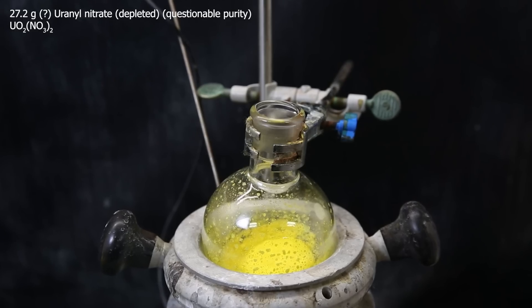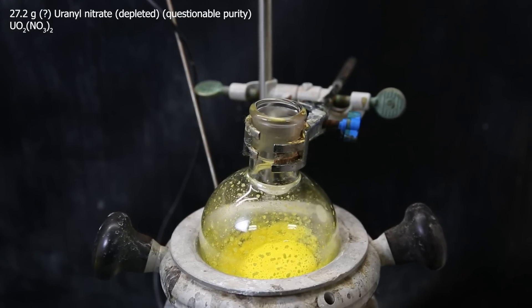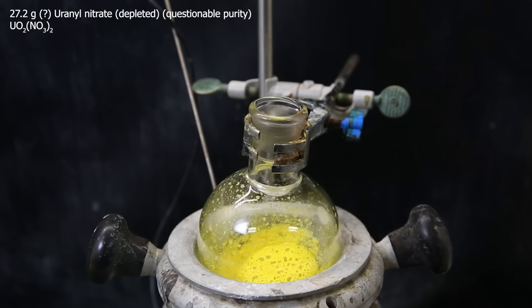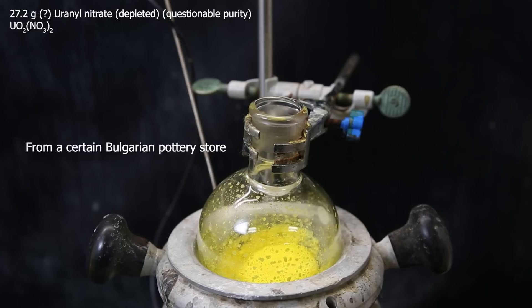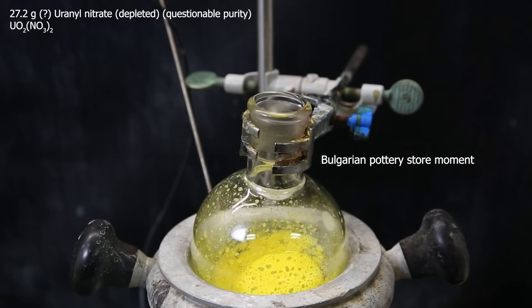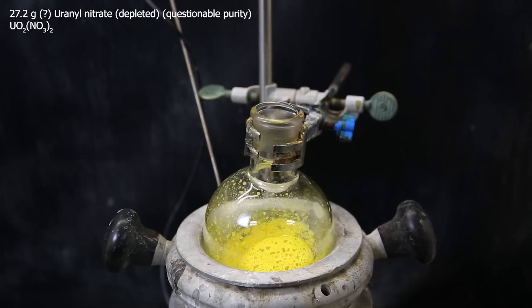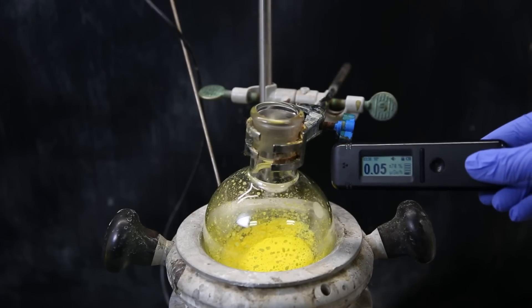So in this flask, I have some uranyl nitrate with questionable purity. Uranyl nitrate can be made very easily from naturally occurring uraninite, as I have shown in an earlier video. But what I have here, I bought directly. I originally had it in solution that I evaporated down in this flask. But that might contain some unknown components because I am a little skeptical about the source, and it might be partially contaminated with thorium oxide as well. Either way, these contaminants shouldn't be relevant for the process, but it will definitely affect the perceived yield. So we will ignore the yields for this one.